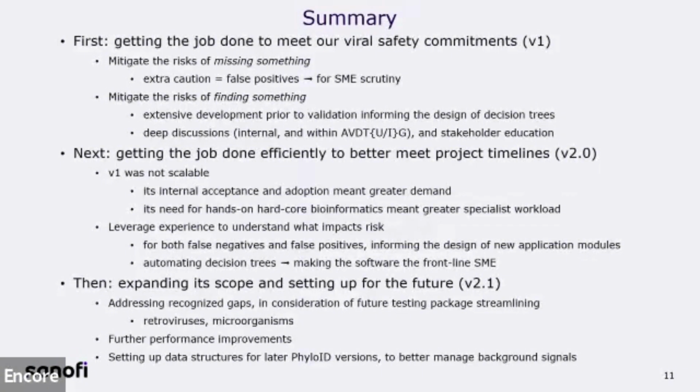Also, it's not wise to rely on people with great specialties and expertise. And so if they're doing things in a specific way, then we just automate that. In other words, making the machine the subject matter expert. Of course, people still look at the results in the end, but they don't have to do the routine looking at results. We wanted to leverage the growing experience to improve the decision trees.